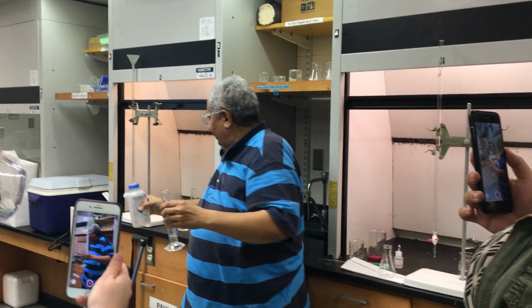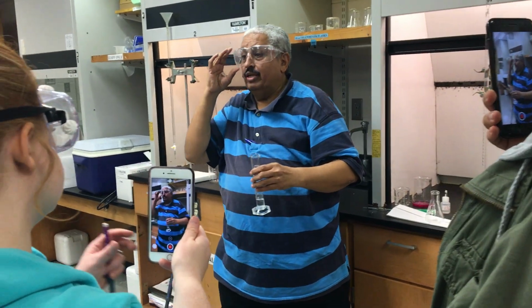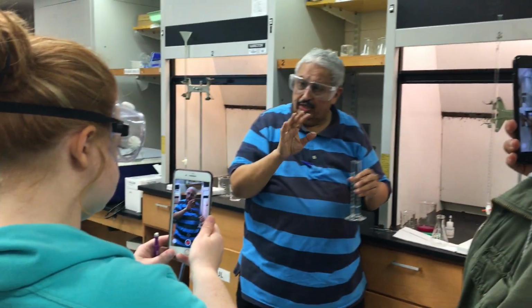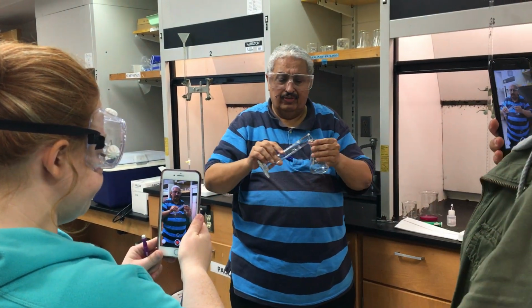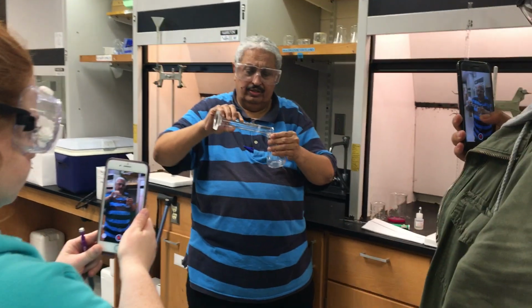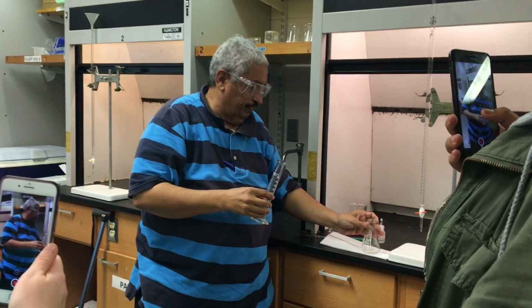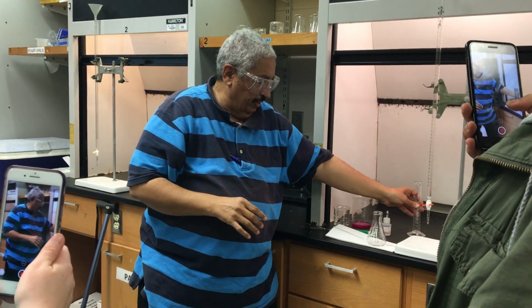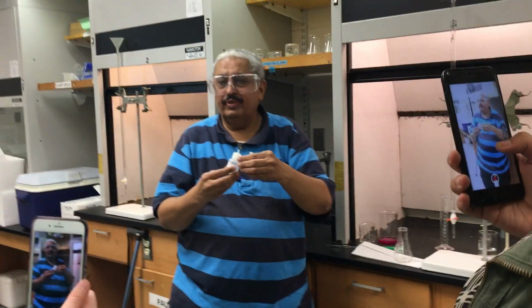Yeah. So if I added 15 or 20, it does not really matter, because I'm calculating the number of moles. The H2O here is added just to help me visualize the pink color. So here it is, this is my H2O. I need the indicator.